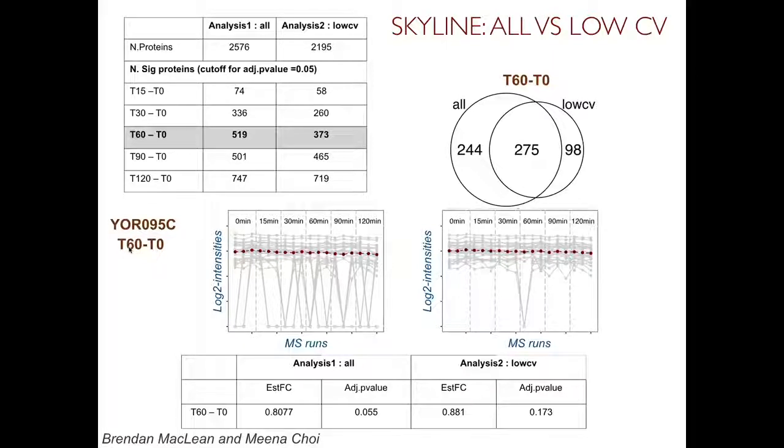So this is a protein which is not changing in any of the analysis. So here the p-value is large, although here the adjusted p-value.